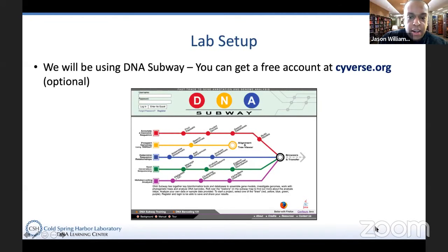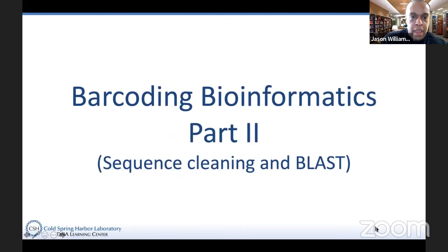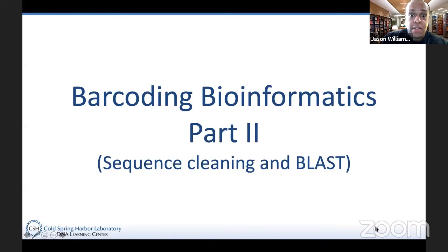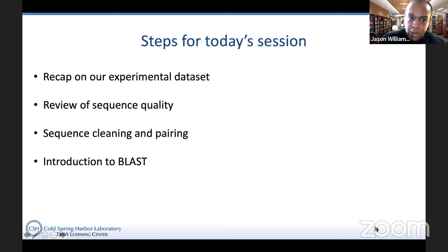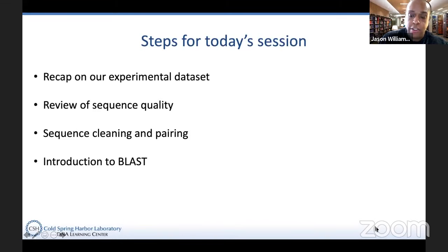You'll want to go to DNA Subway, which you can Google or go to cyverse.org. We recommend you get an account, but it's not required — if you get an account, your work will be saved, but you can also follow along using a guest account. This episode is all about sequence cleaning and BLAST. The steps we'll cover: a recap of last week, sequence quality, experimental design, sequence cleaning and pairing, and an introduction to BLAST.